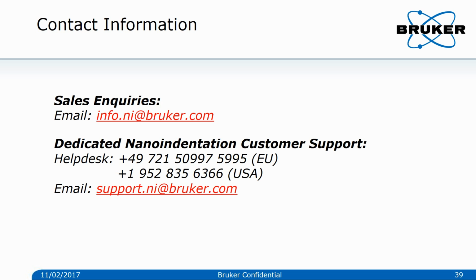Next question. Can I use the CMX depth profile technique to measure film thickness? It is difficult to determine the film thickness from a CMX experiment. Only in the case of a very soft material on a hard substrate, the transition of hardness and modulus will be very steep, and it could be possible to determine it approximately.